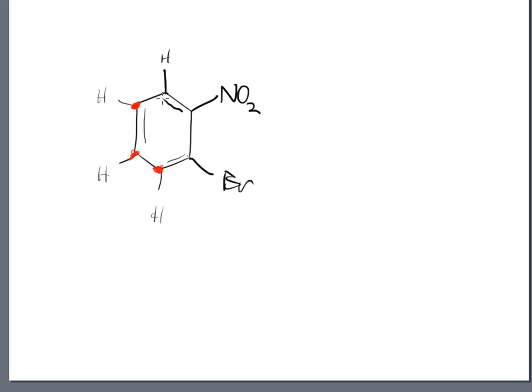The problem, though, is that this is still a ding dong type of carbon and proton, and the reason is because this one is next door to a nitro group, and this other position was not near a nitro group. So that nitro group does make them different, even though we can talk about doubling up on orthos and metas and paras and so forth. So we do get 4 signals from this molecule.